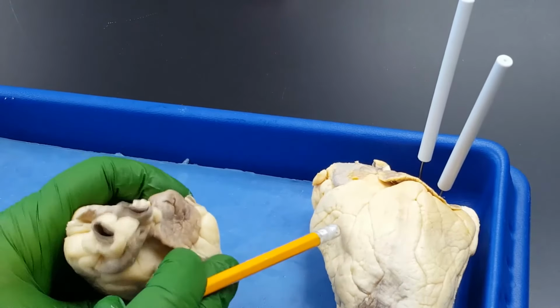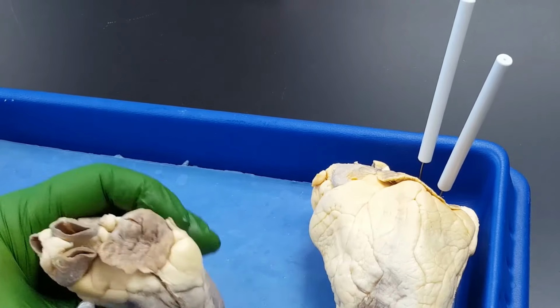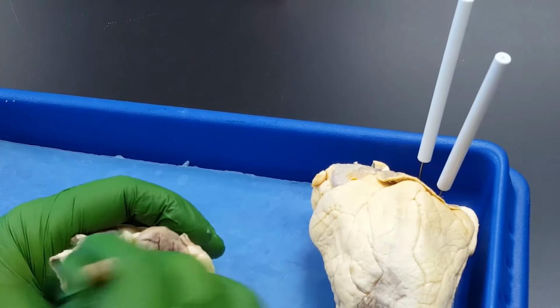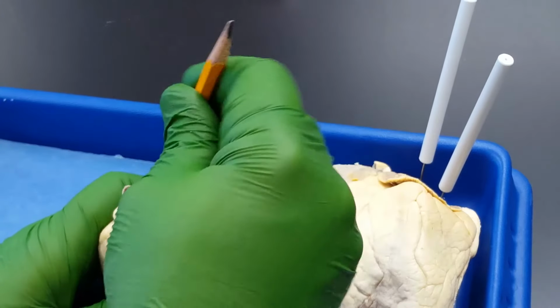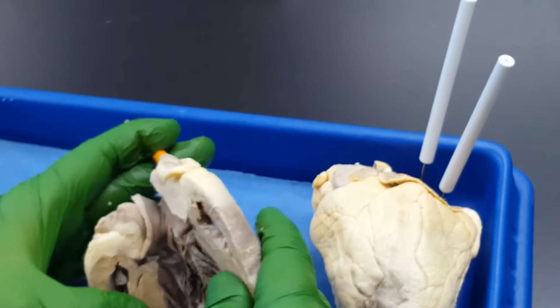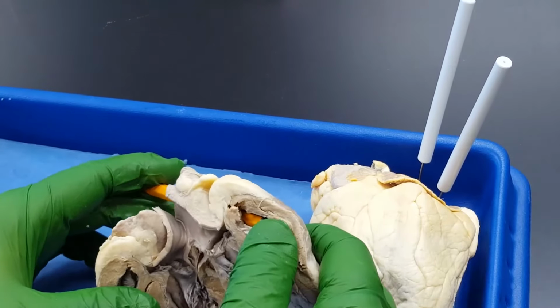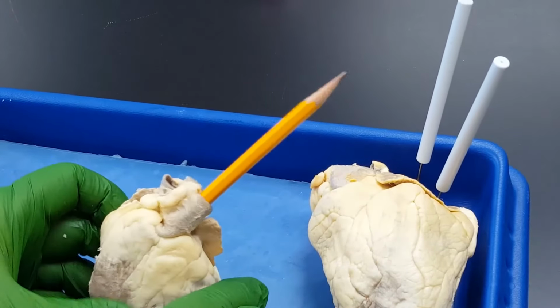Let's try this one. So I've got these great vessels here. I see this one. I'm suspicious because it's on the front surface. Let's see if I can get my pencil in there in this smaller one. Oh yes, look at that, kitty wampus on the front or the anterior surface. And I keep wiggling and oh look, I just got into a chamber. Where's that pencil tip, everybody? In the right ventricle, which makes this the pulmonary artery.